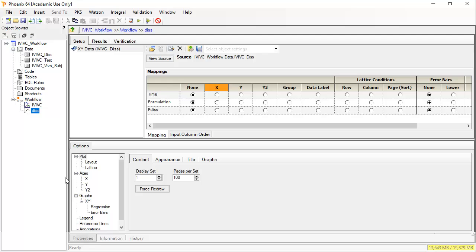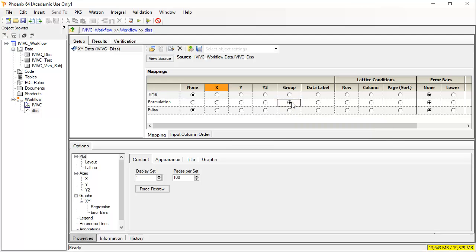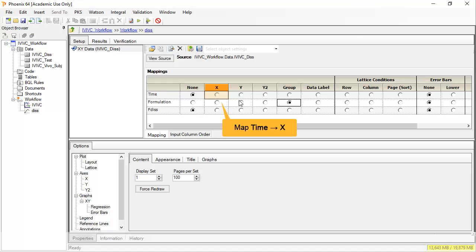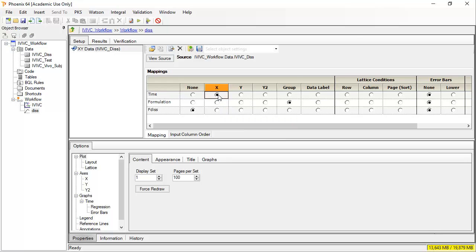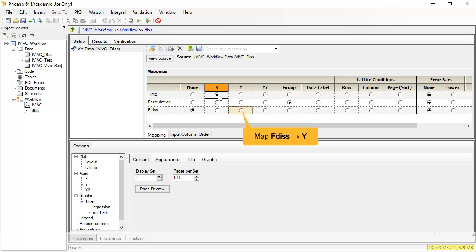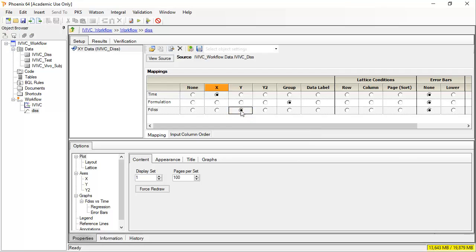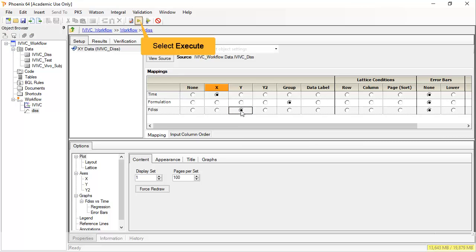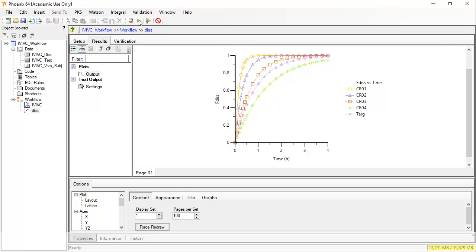By mapping formulation to group, they will appear as separate lines on one page. Then map time to X and FDIS, the fraction dissolved, to Y. Then execute by clicking the green arrow. We can see four controlled release forms, with CR1 being the fastest and CR4 the slowest. The target falls between CR3 and CR4. The target is what we are trying to match and may be the innovator.